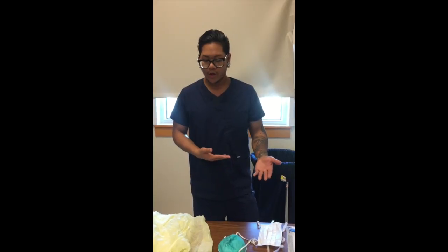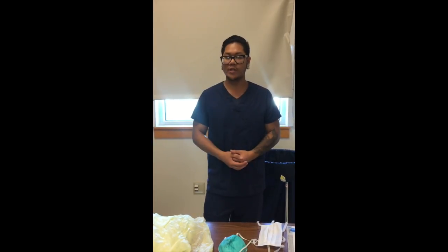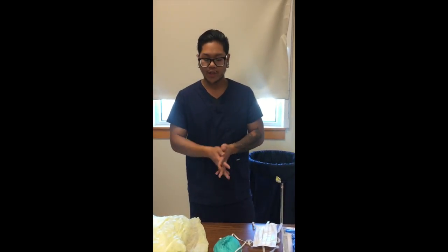Okay, so I'm going to show you what to do before you go into a room. You're going to check the patient's chart and see what they have, if they're sick or if they have any contact precaution, airborne precaution. In this case, we'll go with isolation. So before you put anything on, you wash your hands first for 15-20 seconds, or you can use hand sanitizer. You can use both, hand sanitizer and then wash your hands.